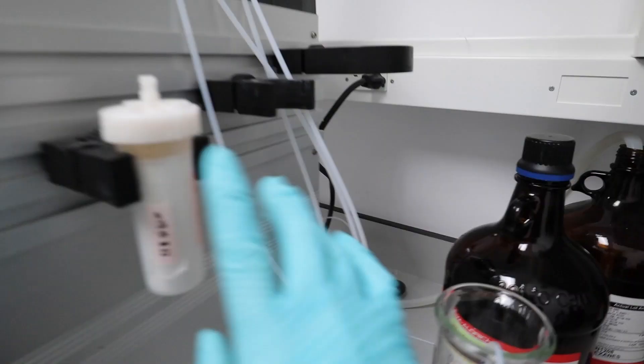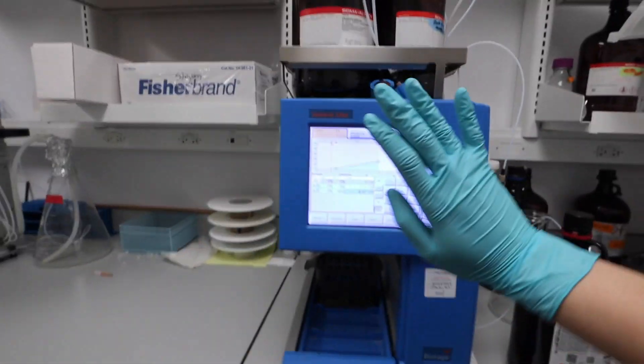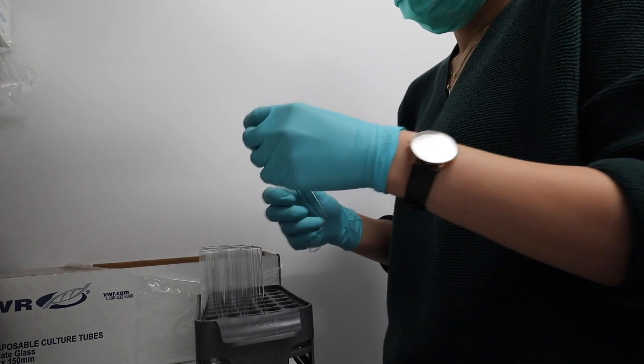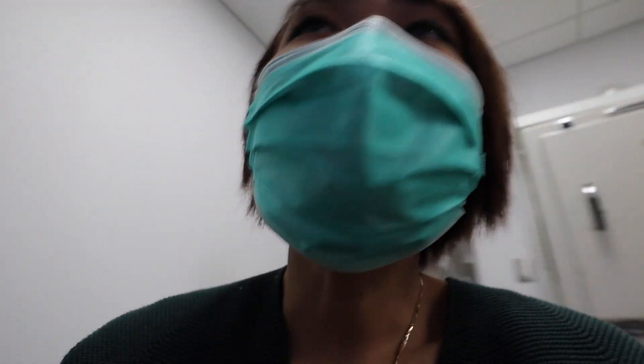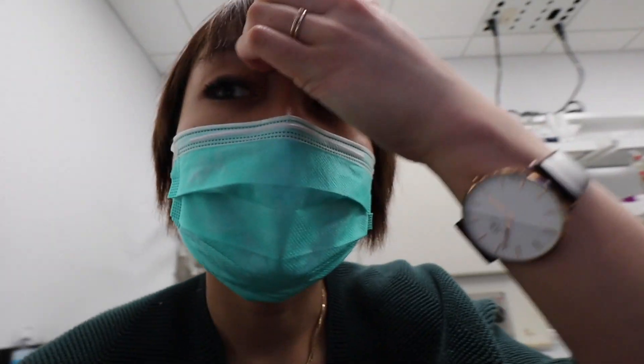I think this stuff is impurity, should come out first, and then my compound and then the starting. Let's go column. All right, I have my compound loaded onto here. I have not seen this in so long. I don't know why they removed these two though, something wrong with it I don't know. Oh my gosh, it's already starting to collect something pink here and this is all pink.